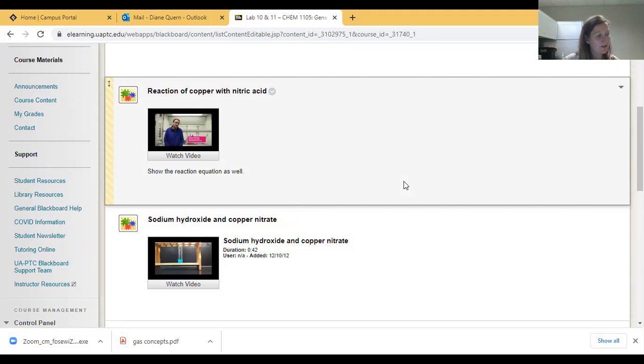Notice on page 67 that it says give your answers in complete sentences. So make sure you can take notes off to the side, but when you write out what's happening when we added the concentrated nitric acid to the copper wire, write it in a complete sentence. You know, the solution started bubbling and a brown gas began to form, which was nitrogen dioxide gas. And just explain the whole thing. What did it look like before, during, after? So complete that for the first 3 reactions.